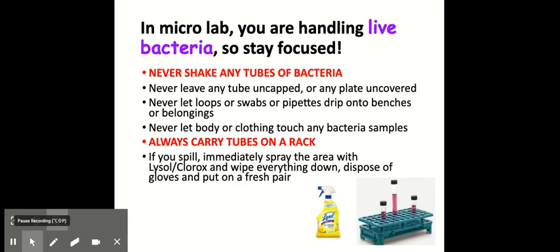In micro lab, you're handling live bacteria, so you should always stay focused. That means never shake any tubes of bacteria, and never leave any tube uncapped or any plate uncovered. Never let the loops or the swabs or pipettes drip onto the lab benches or onto your belongings. Never let your body or clothing touch any of the bacterial samples. Always carry the tubes on a rack. If you do spill, immediately spray the area with Lysol or Clorox bleach and wipe everything down, and dispose of your gloves and put on a fresh pair.